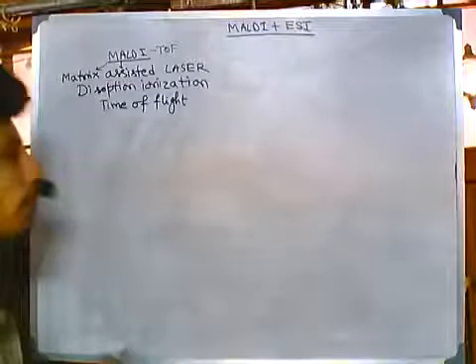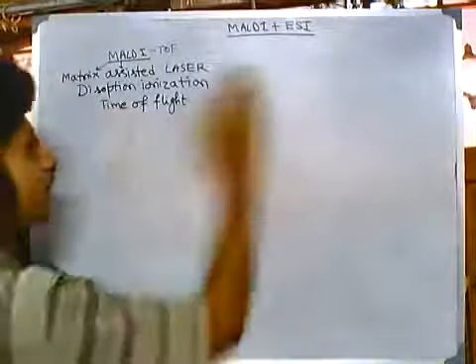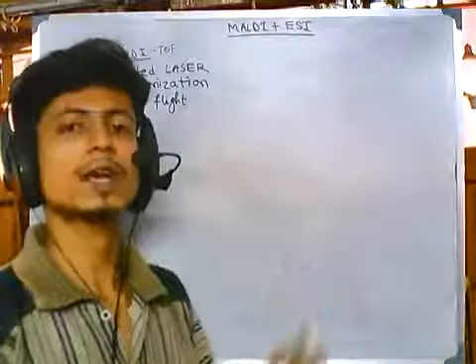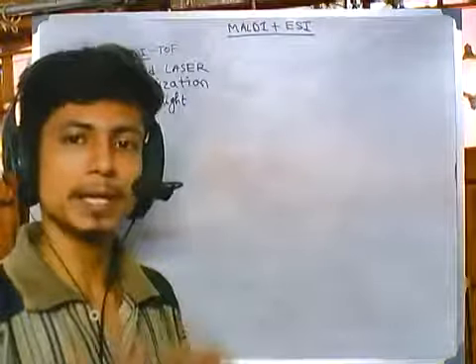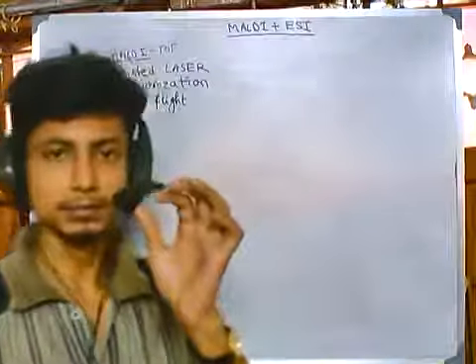What is the process of MALDI TOF? I'm not going to discuss the whole mechanism of mass spec again, but the region where different mass specs differ is the source region and the process of ionization. This part varies from time to time; otherwise, the main principle remains the same. We need to generate the parent ions, right?